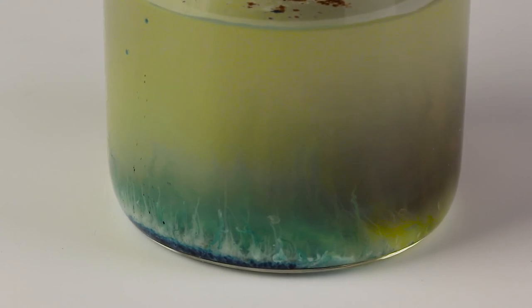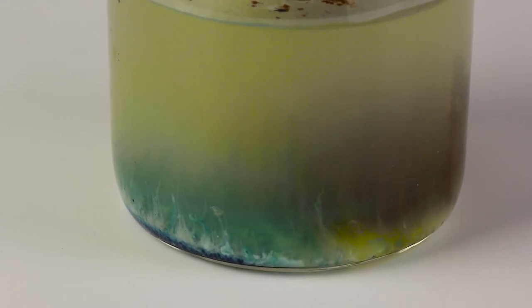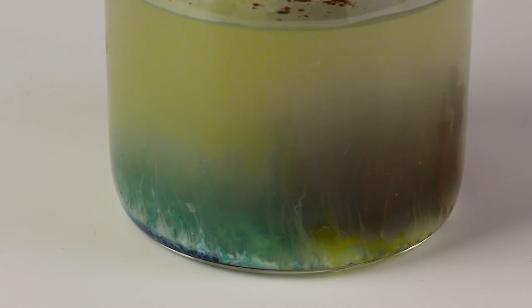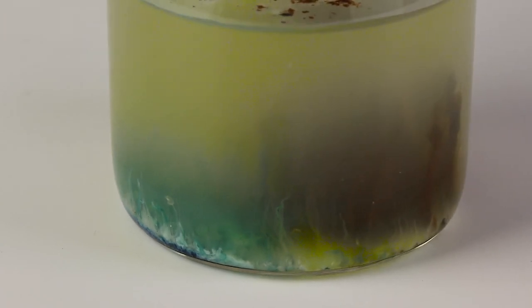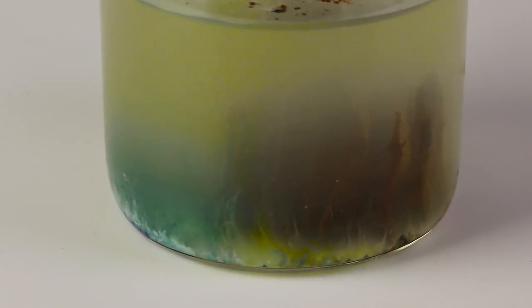Copper hexacyanoferrate is brown, while ferrous hexacyanoferrate is blue. Consequently, a color change can be observed during the experiment for these two salts.